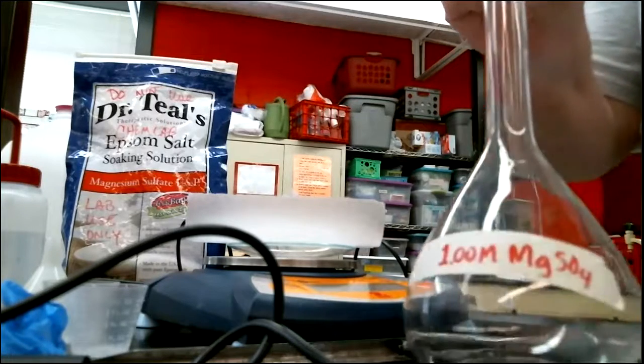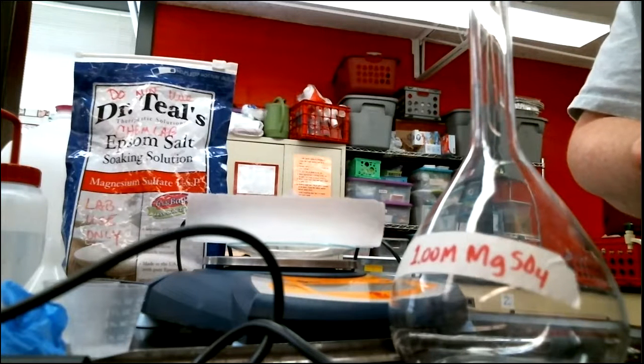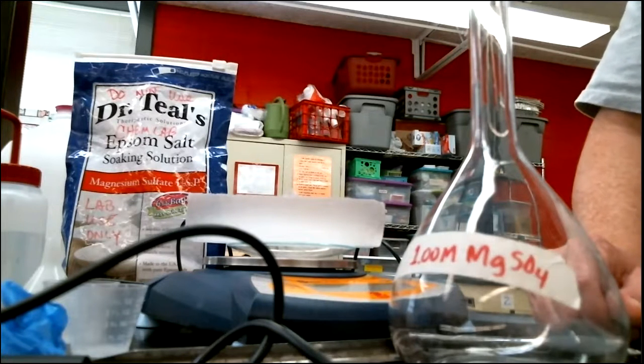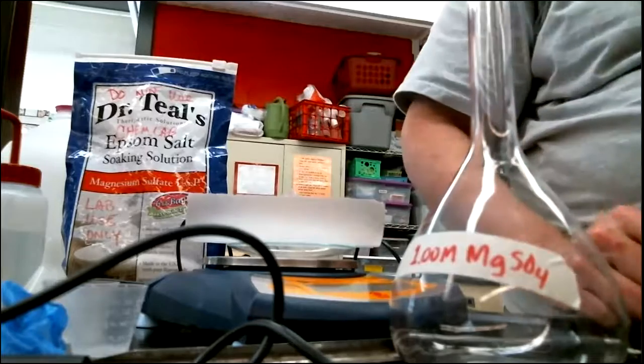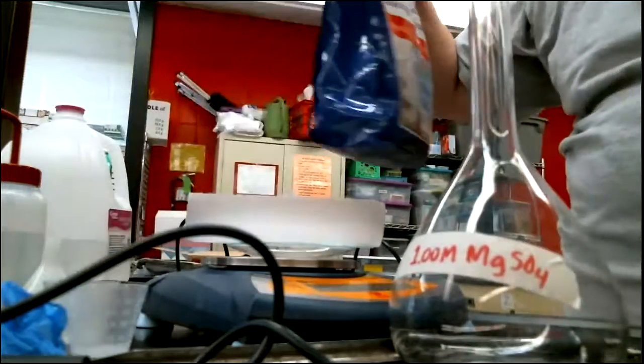So if I need half a liter, then hopefully you can figure out that I need half of my mass that I calculated. So instead of the 120.367, I'm going to need 60.18 grams. So we're going to measure out 60.18 grams of Epsom salt.